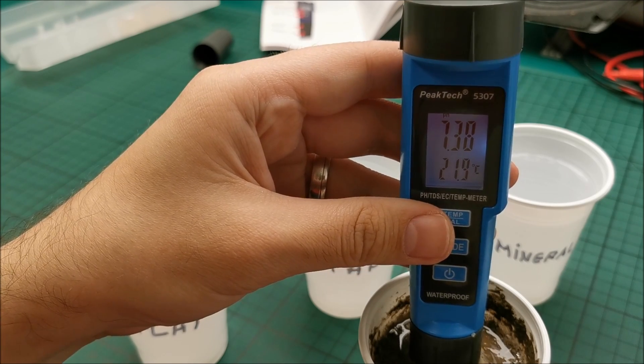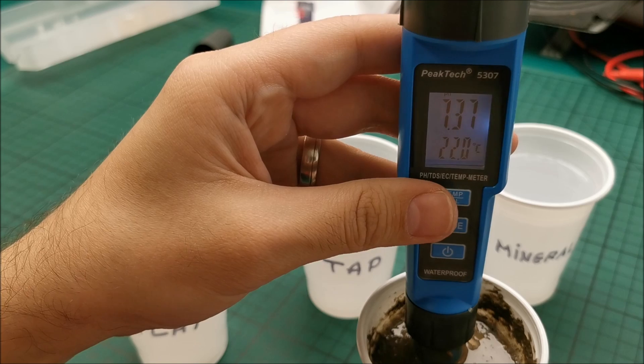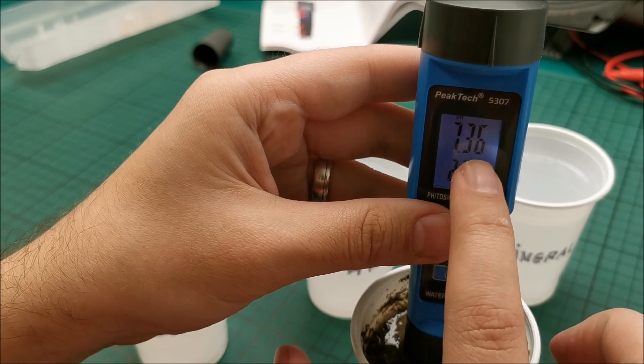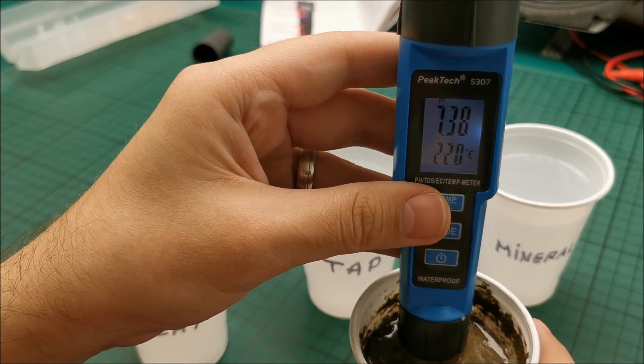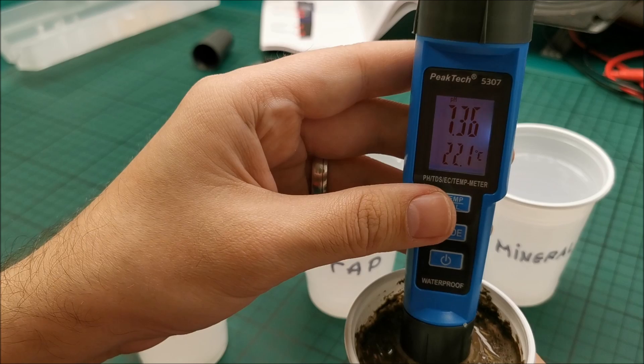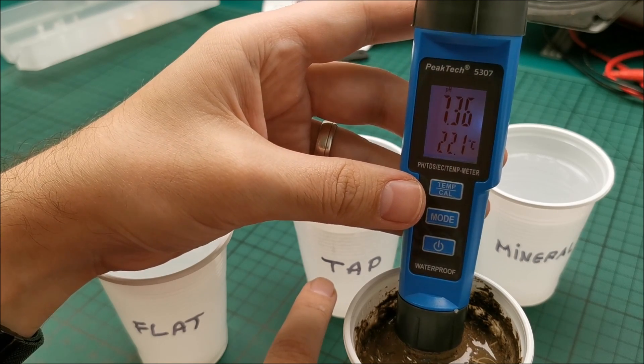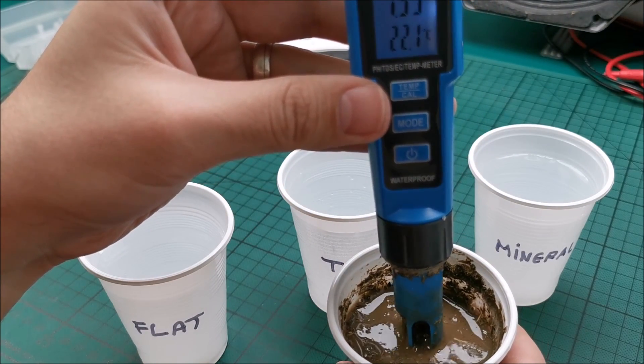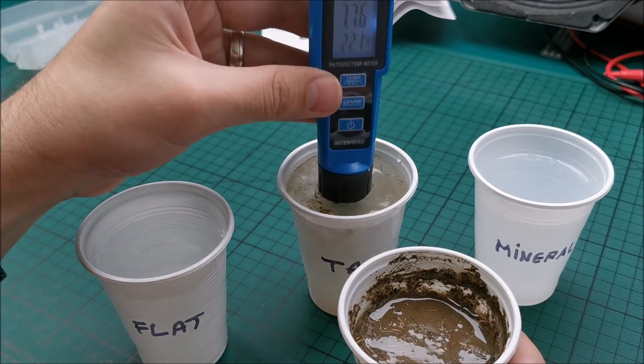Anyway, let's poke it in here. Okay, so the reading is almost identical to the tap water. So basically the soil is quite okay. I might do this test with even less water, but the soil should have changed it if it was really bad, either alkaline or acid should have changed this reading by a significant amount. In my opinion this is not for testing soil, what I'm doing here, it's not its purpose, but at least it tells me that there's no huge problem as far as I can figure it out. Yes, it is making the tap water a bit less alkaline, so this is a bit more acidic actually, the soil itself, but doesn't make the change by a whole lot.